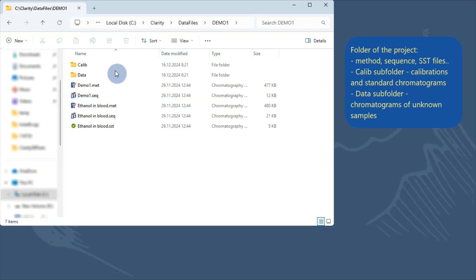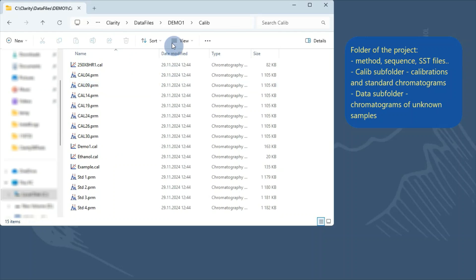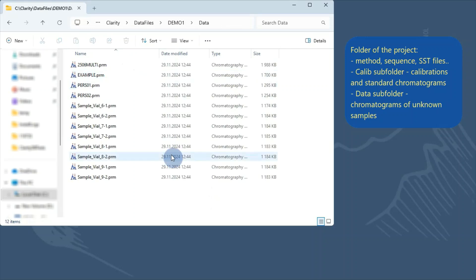The Calib folder, that stores calibration files and chromatograms measured as standards or blank sample types. And the Data folder, that stores chromatograms of unknown samples or bypasses.